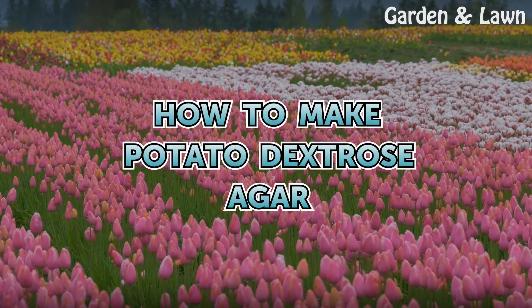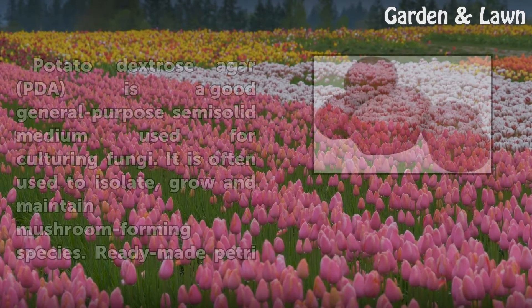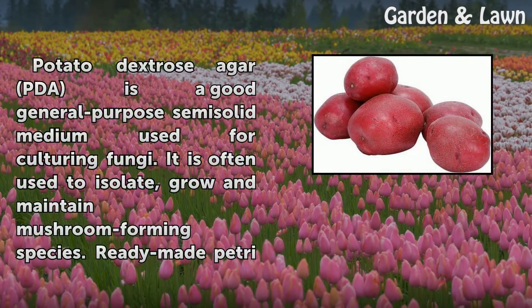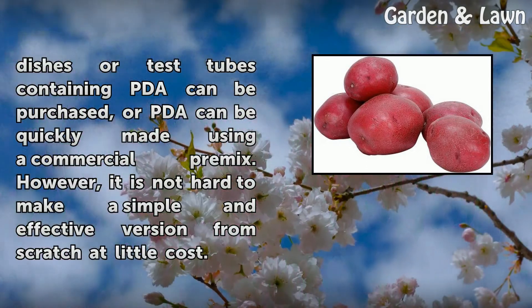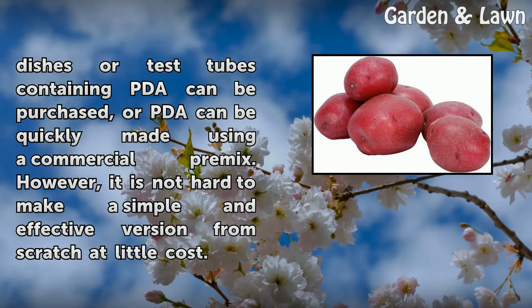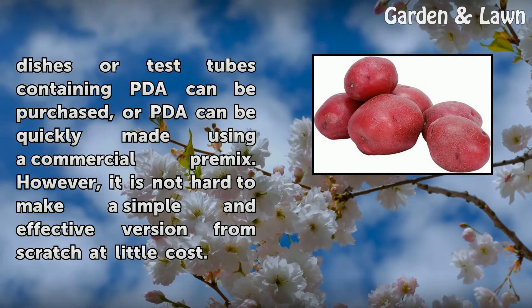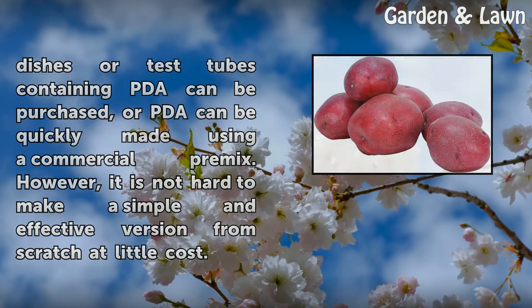How to Make Potato Dextrose Agar. Potato dextrose agar, or PDA, is a good general-purpose semi-solid medium used for culturing fungi. It is often used to isolate, grow, and maintain mushroom-forming species. Ready-made petri dishes or test tubes containing PDA can be purchased, or PDA can be quickly made using a commercial pre-mix. However, it is not hard to make a simple and effective version from scratch at little cost.